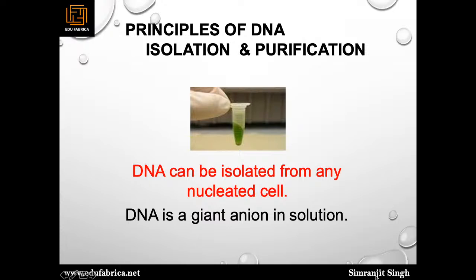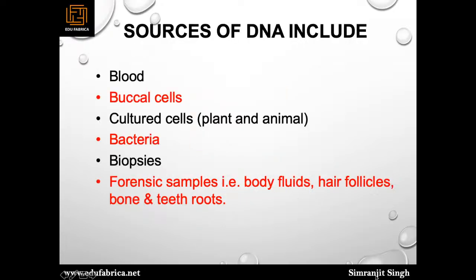So we will discuss a little bit about how we isolate and purify our DNA from nucleated cells. What are the various sources that we can use for DNA isolation? That is blood, buccal cells, cultured cells, bacteria, biopsies, forensic samples, all are possible.